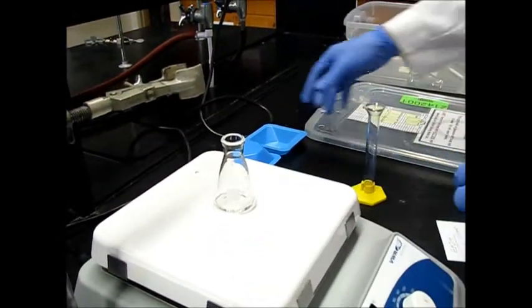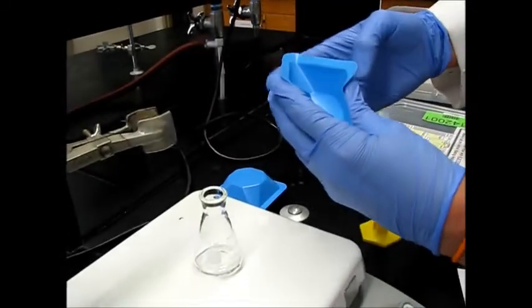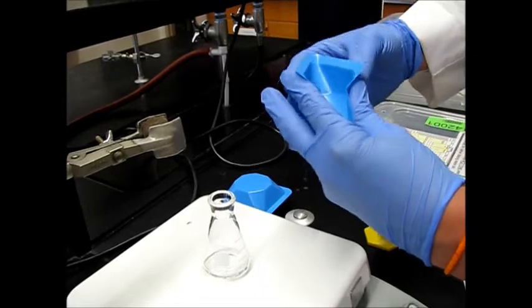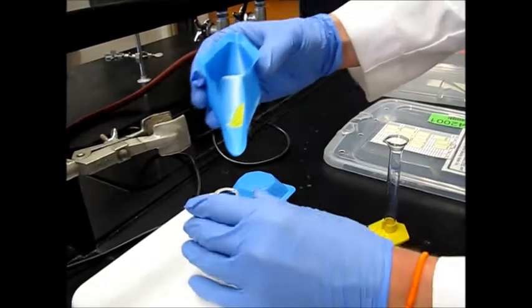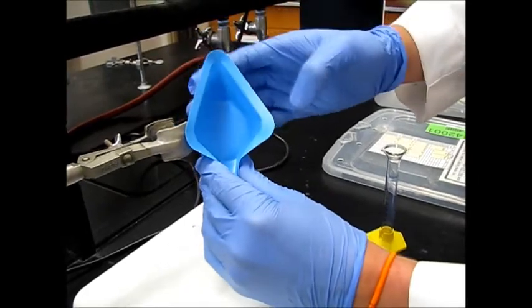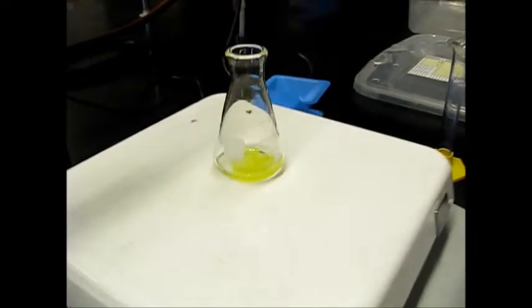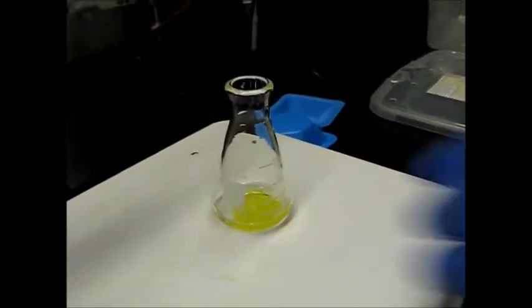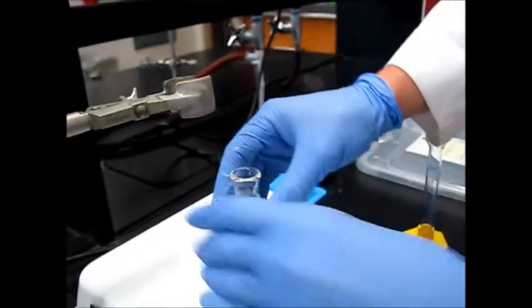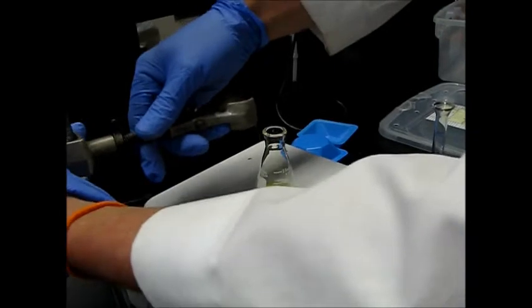So we're going to go ahead and add our reagents right now. This is our 9-fluorenone. I always like to bend the weigh boat so I can get a nice funnel going. Just kind of pour stuff in. Cool. Now we're going to add our stir bar, turn on the stirring plate, and we're going to go ahead and clamp this down so that it doesn't move around.